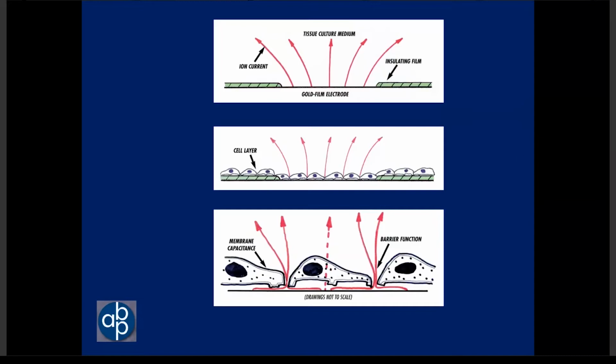We're not talking about current being carried through ion channels. They're many too few, and they're too small to account for any part of the measurement we normally see. We instead are coupling by charging and discharging the membrane of the cell very rapidly at usually several thousand hertz.